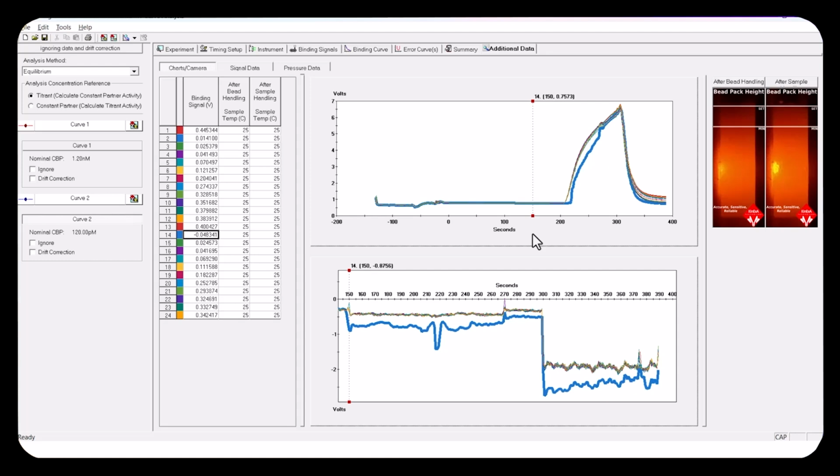So as soon as we switch to label, we see that the pressure has dropped down away from the rest of the group. And I can use the arrow keys here. I can go up 1 or 2 or 3, and then I can come back and go down 2 or 3. And yeah, they're all in a group right there, except this one. And this one looks pretty odd.